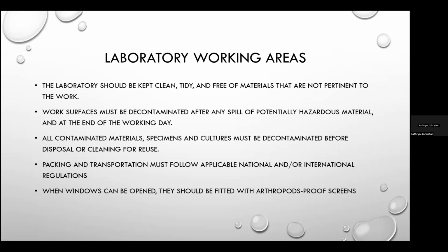So if you have laboratories with windows, those windows should have screens to prevent the influx of those types of things. And contaminated materials, specimens, and cultures should be decontaminated before disposal.